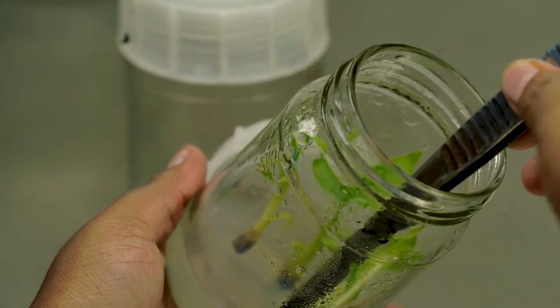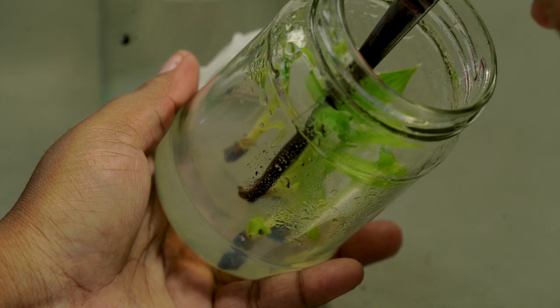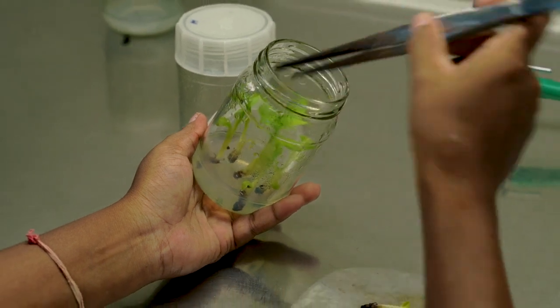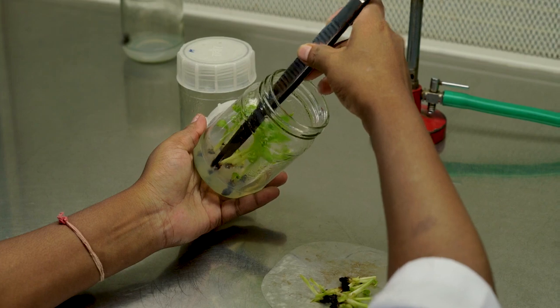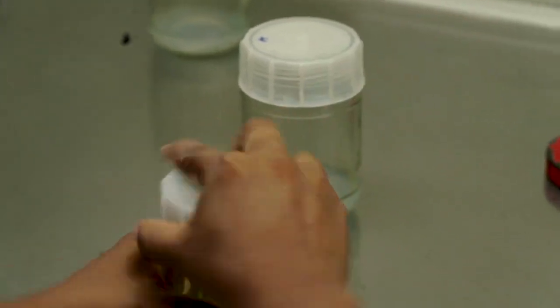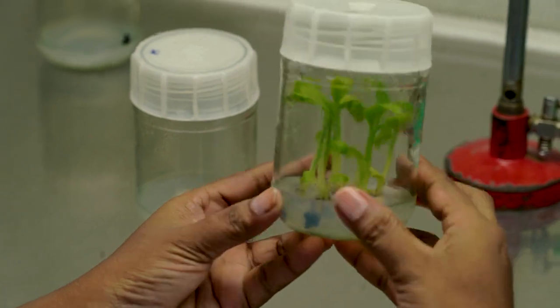As you can see here, micro plants were transferred into rooting media. Rooting media is also very important. It helps in proliferation of the roots, whereas some of the shoots are of smaller size, so these shoots will be transferred into multiplication media for further multiplication.